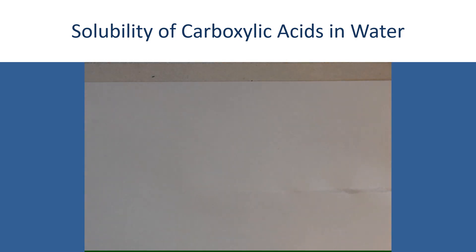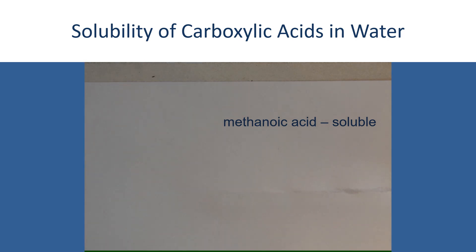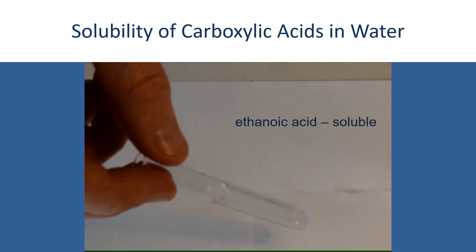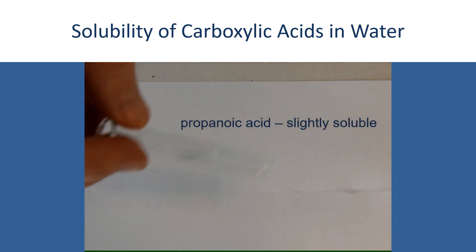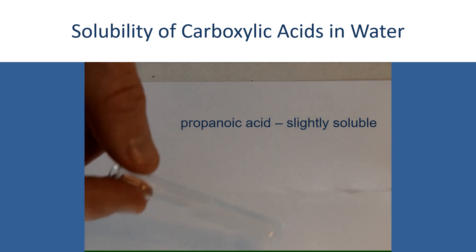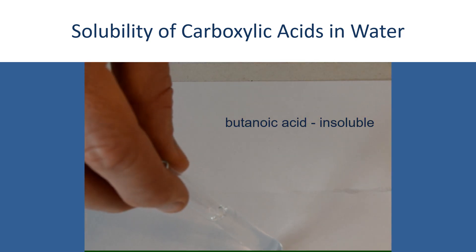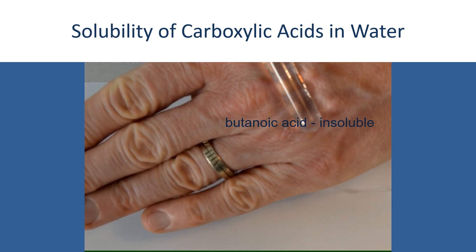So if I move these out of the way so that we can have another look at them in front of the camera: the methanoic acid there has completely dissolved in the water. The ethanoic acid — you can see the cloudiness has disappeared and it's become completely miscible in the water; the ethanoic acid is also soluble in water. Propanoic acid has started to become miscible with the water, but it's less soluble — clearly less soluble than the methanoic and ethanoic acids. And finally, the butanoic acid is sitting as a layer there; you can see it's sitting as a layer on top of the water — this is insoluble.